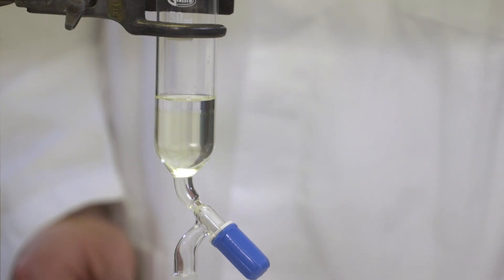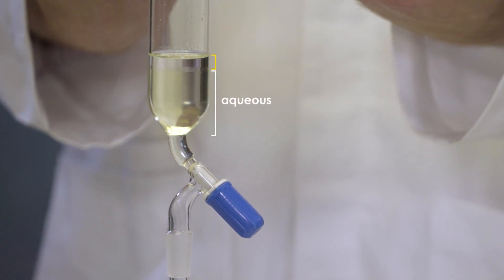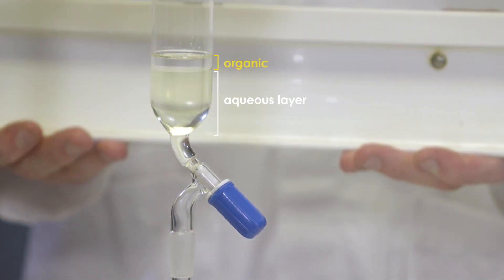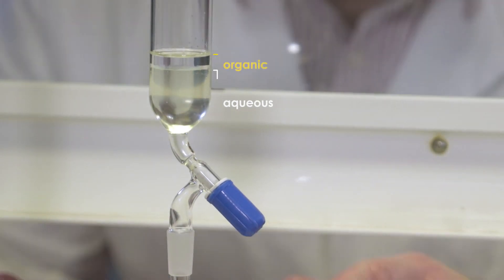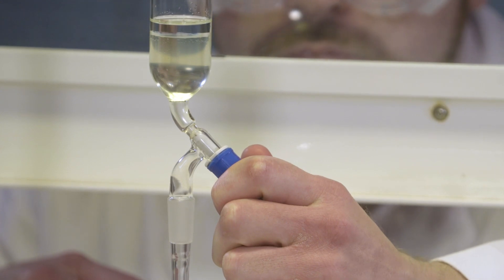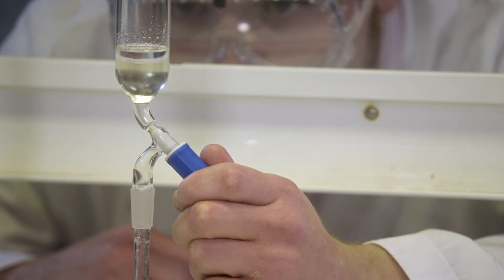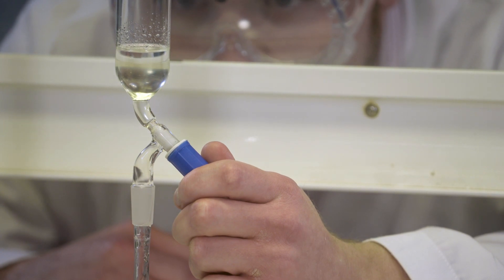Now, you can clearly see we have this cloudy layer at the bottom and this clear layer above. The cloudy layer is the aqueous layer and it's more dense than the organic layer in this reaction. To remove the aqueous layer, we can open the tap and allow it to drain. Another tip, make sure the lid is removed from your separating funnel or the solvent will not run freely.